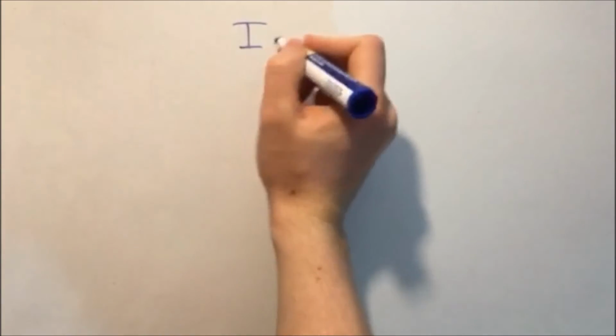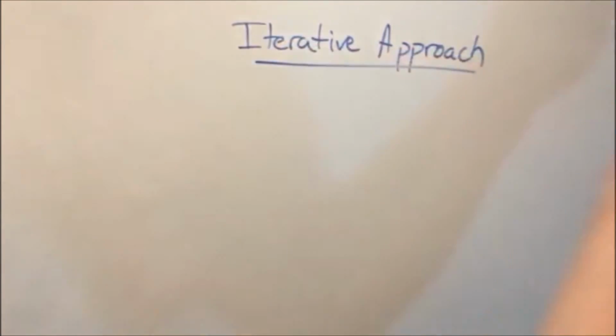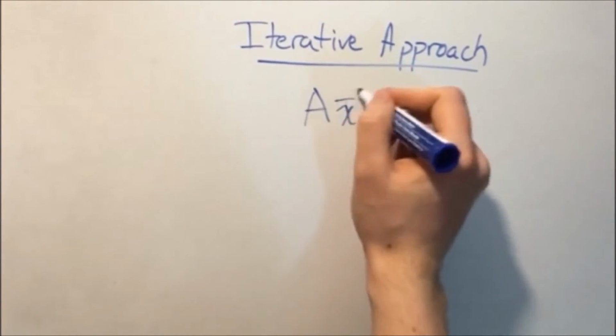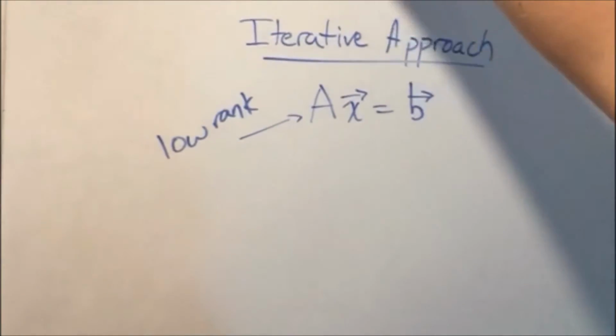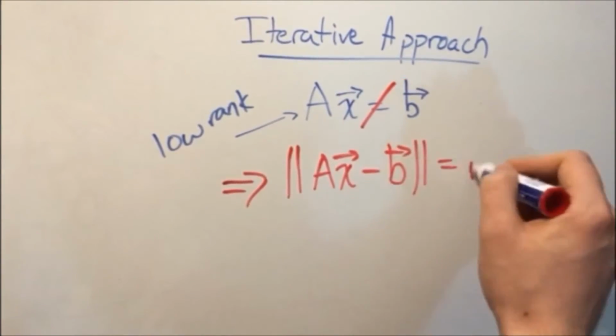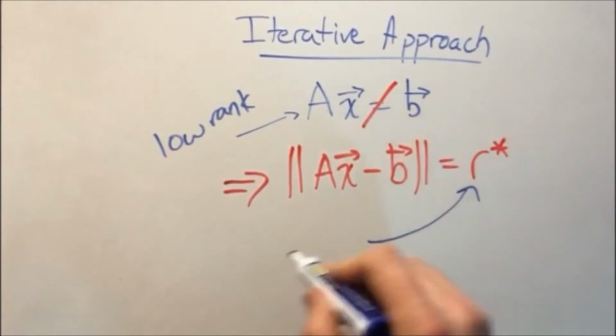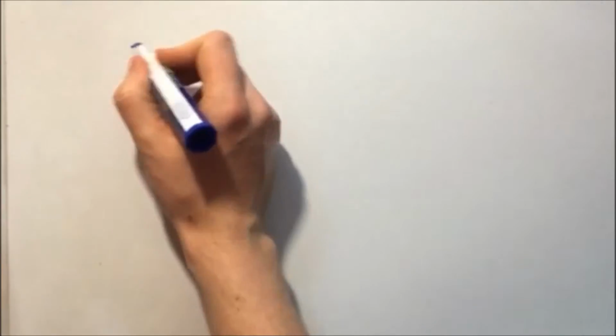To help reduce these significant artifacts, several iterative methods have been devised. The general approach to these techniques is to realize that the missing wedge creates an underdetermined linear system. In addition, due to noise, this system is likely to be inconsistent, so the system of equations that need to be solved will instead be an optimization problem to minimize the residual of the system.